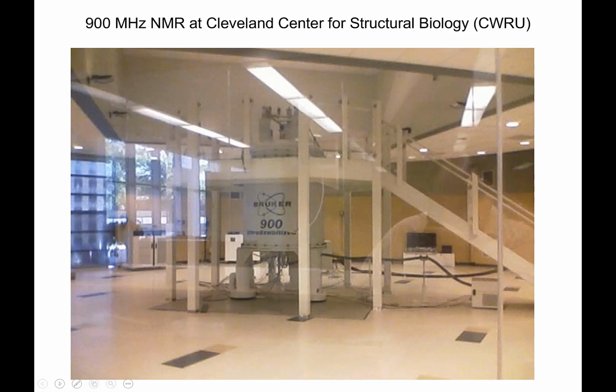To get to the top of the magnet, to put your sample in, you have to walk up the stairs. None of this is magnetic, so all that metal has to be non-magnetic. And with this one you can actually get to the stuff down here without going down, but some of them you have to go downstairs more than this. That's going to be a 21, 22 Tesla magnet. Yes, it's a building. We're in the control room, keeping the computers and everything working.